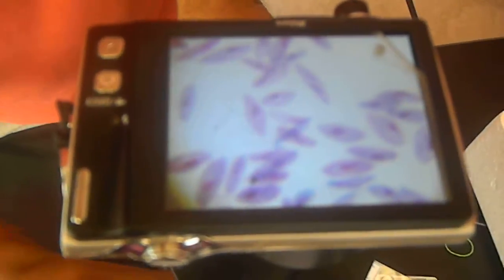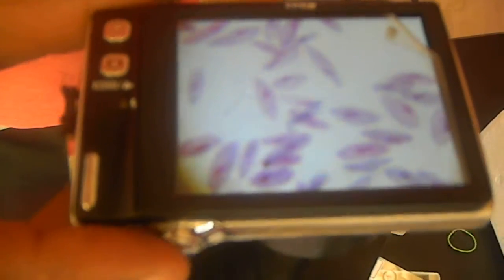You can press second focus. I change it to 45x. The image will be there. Press it again so that the image is visible. If you have to bring it the center of the image, you can bring by focusing the hand slide movement. Now it is focused. Click it again.